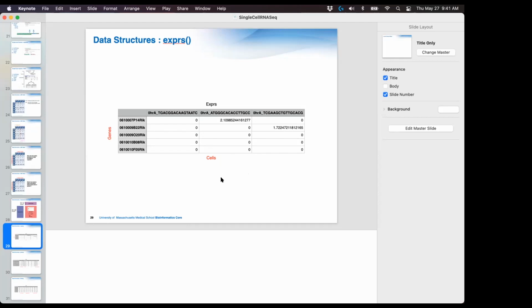So I want people to understand: if you want to work on all transcripts in the cell population, then don't do single cell. If the genes you're looking for have low abundance in a cell, you might not capture that gene.